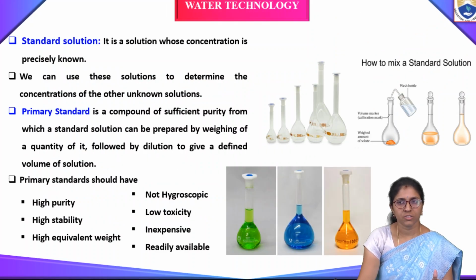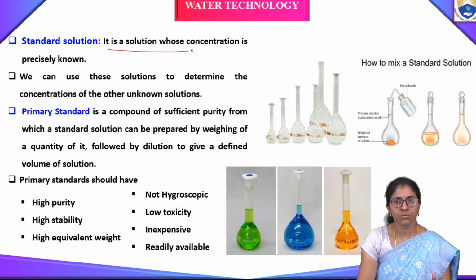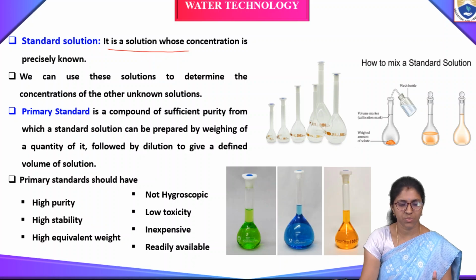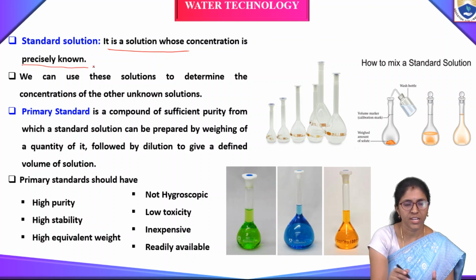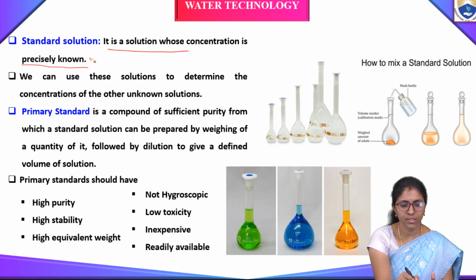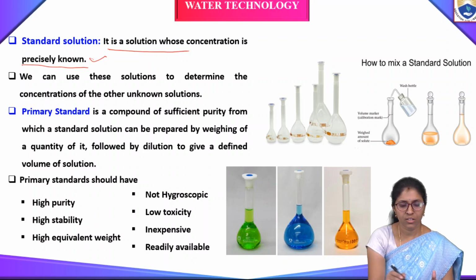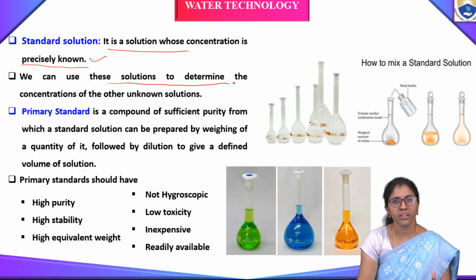What is a standard solution? A standard solution is a solution whose concentration is precisely known, a solution of known concentration. We can use these solutions to determine the concentration of other unknown solutions. By using a standard solution, we determine the concentration of unknown solutions.